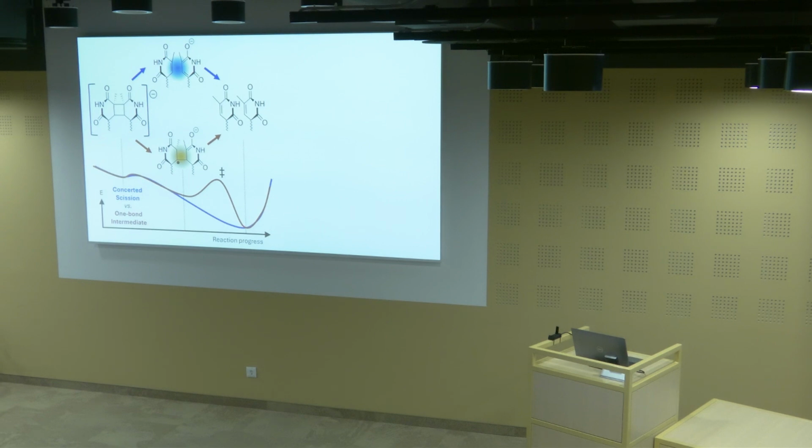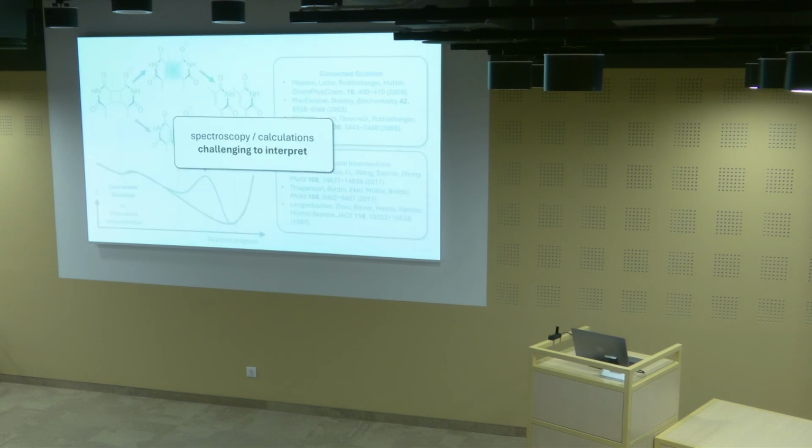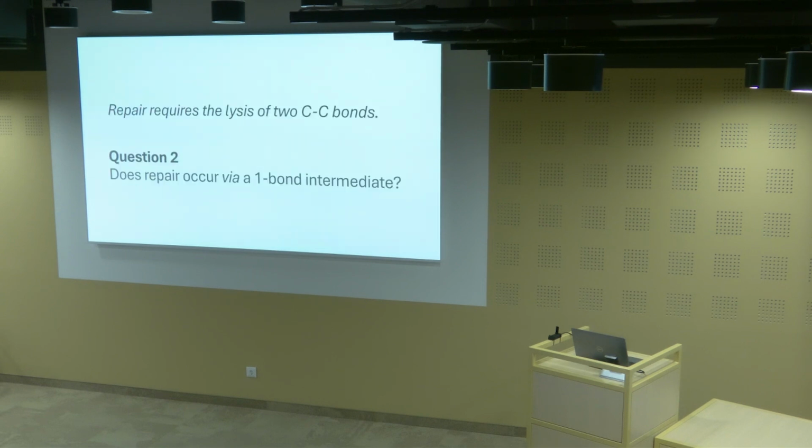And this had been debated for quite a while. I would say there was probably significant evidence, but not conclusive, for this one-bond intermediate. But all of these spectroscopy and computational studies were challenging to interpret or to adjudicate between, and this debate basically continued. And of course, that's another question that we can answer with time-resolved crystallography, hopefully by looking for this one-bond intermediate and seeing if we could capture it.